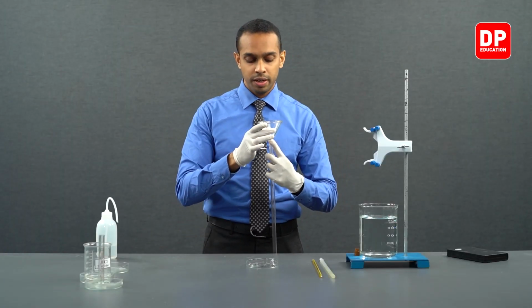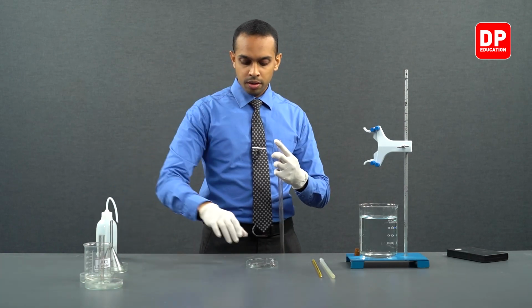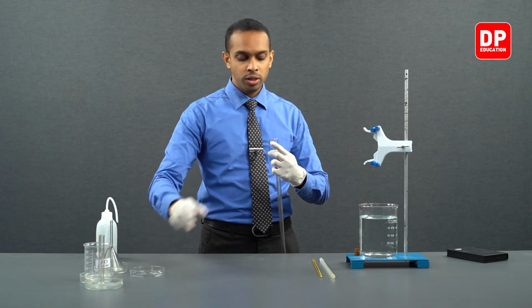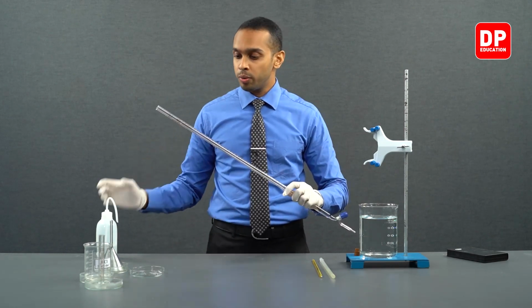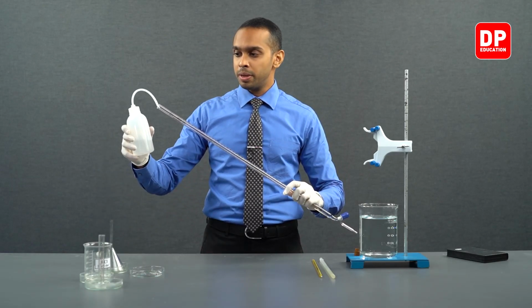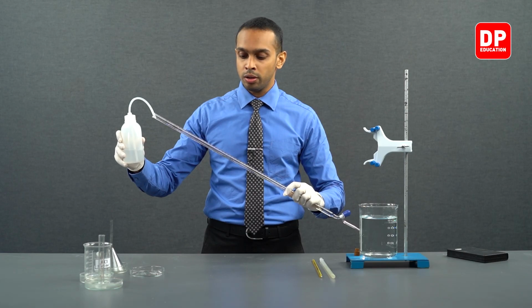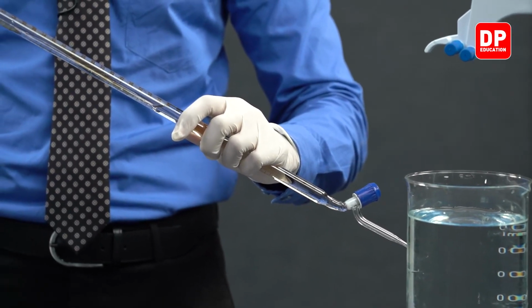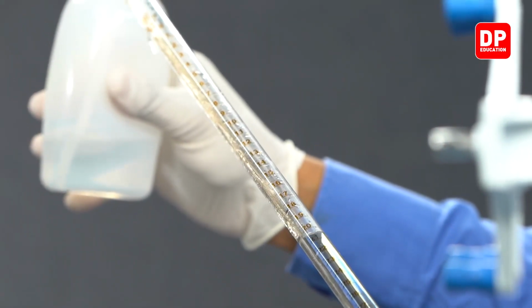After adding our HCl, we are going to add water, just like in the previous two attempts, without disturbing the HCl layer. We are going to add water along the wall of our burette, like so. You can use a wash bottle for this purpose.